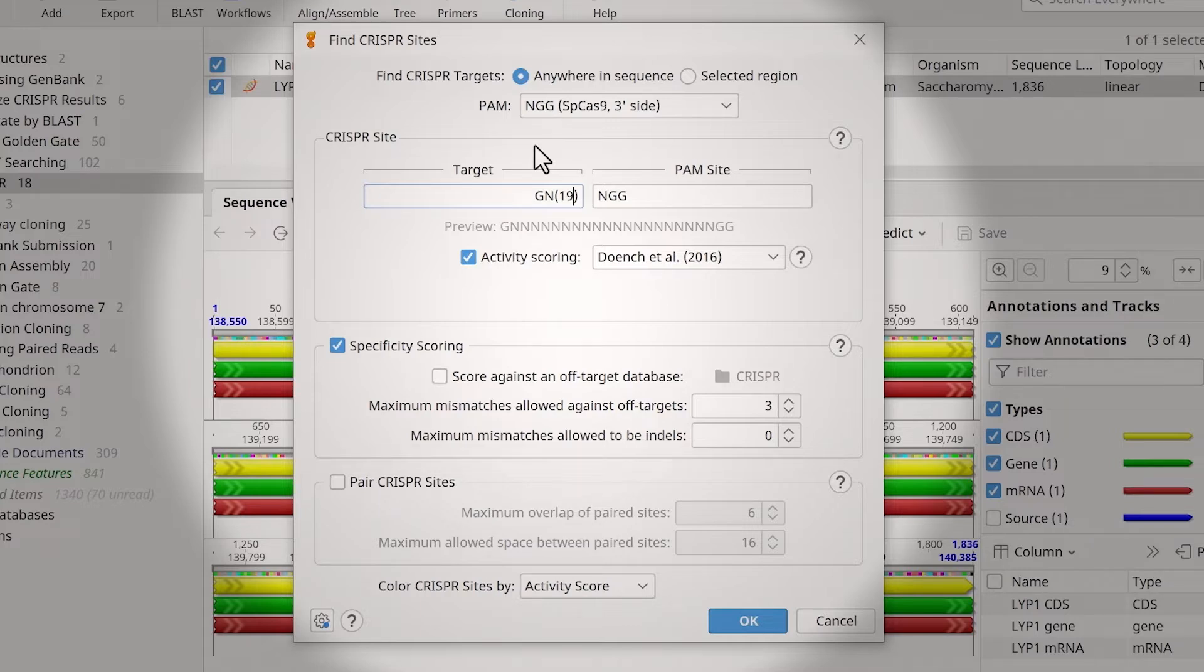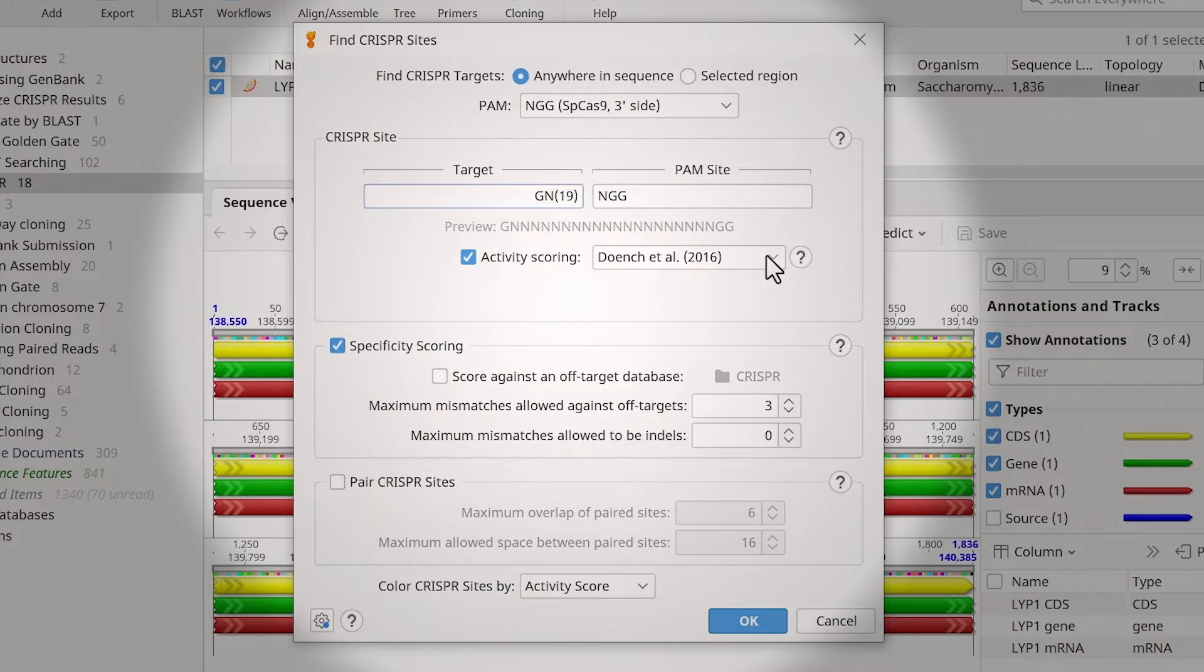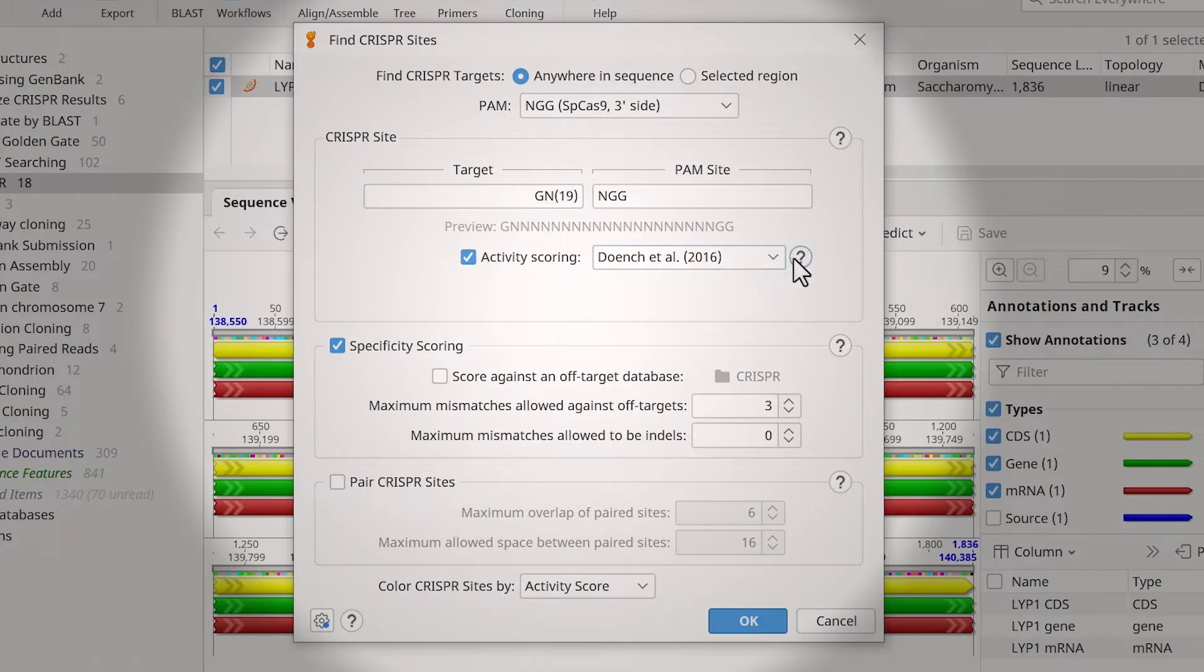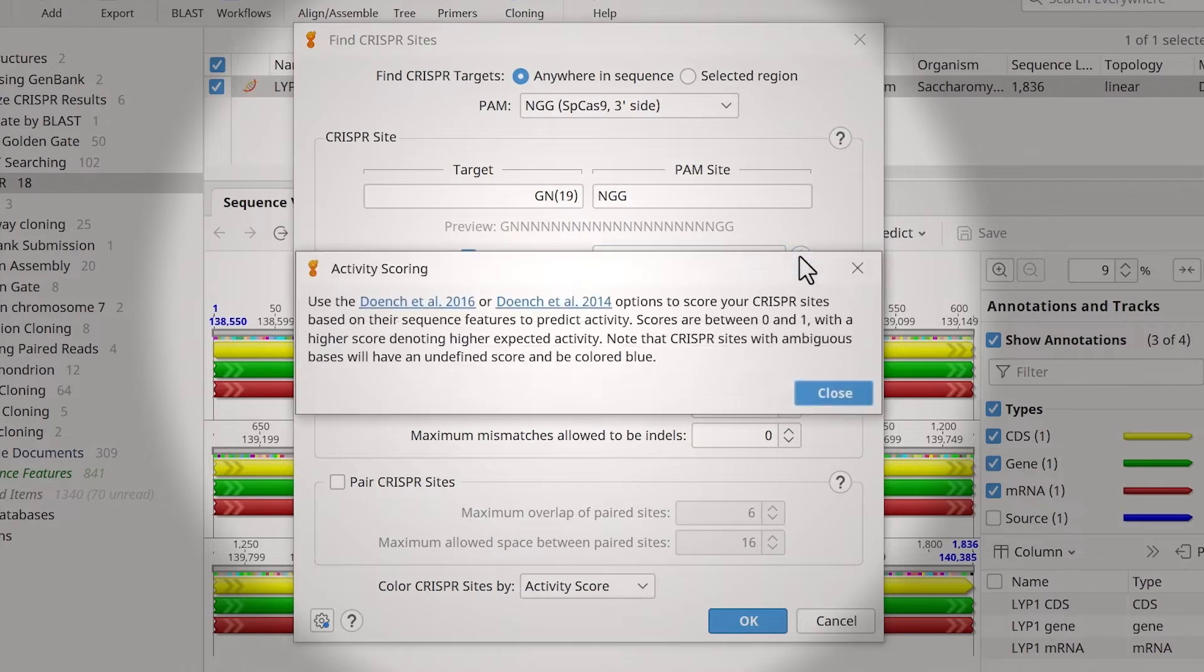The preview text below the fields shows the sequence. Also, select the desired activity scoring method. To learn more about these, refer to the Hints window.